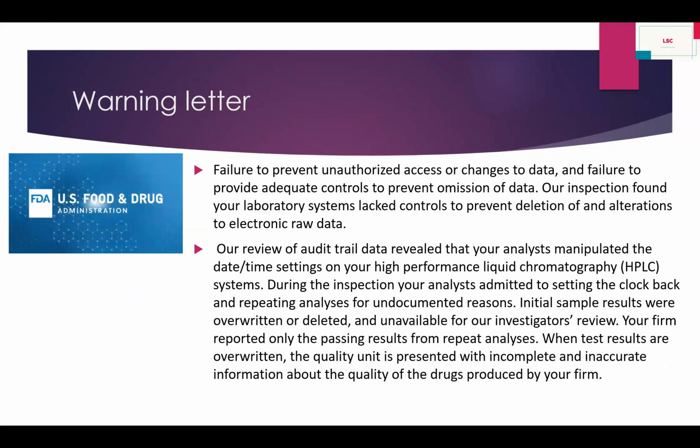Next, failure to prevent unauthorized access or changes to the data, and failure to provide adequate control to prevent omission of data. Our inspection found your laboratory system lacked controls to prevent deletion or alteration of the electronic raw data. So remember that unauthorized access to any software is not allowed.